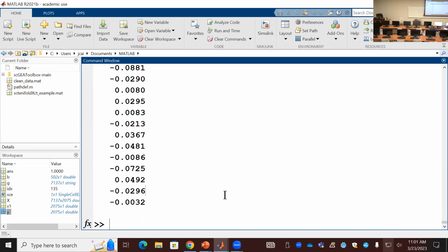Violin plot, because they are zeros, that's why the shape is not good. The bubble size tells you, for example, 100% means all the cells have non-zero. And if a small dot, it means only maybe 5% have values.